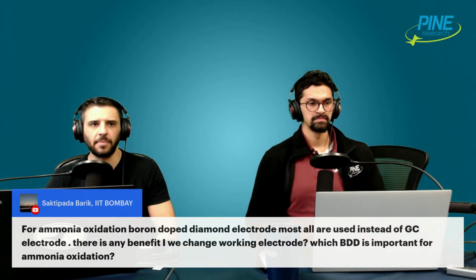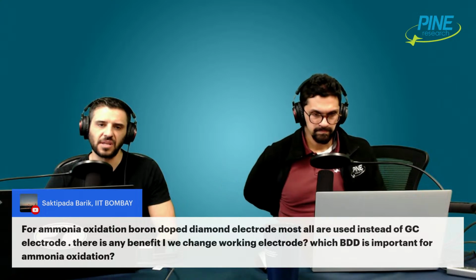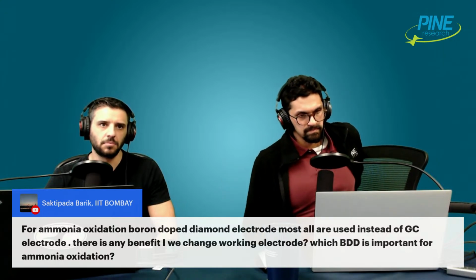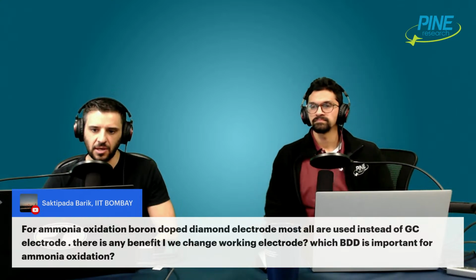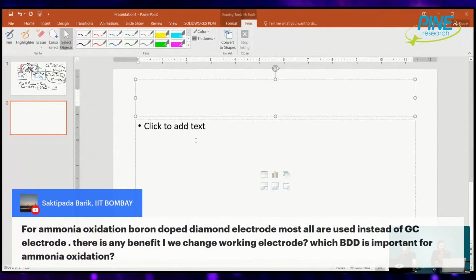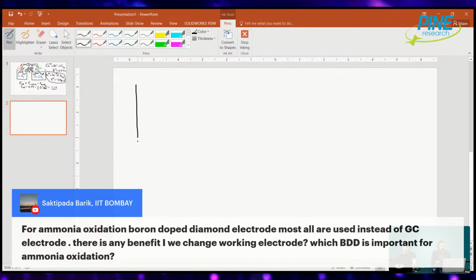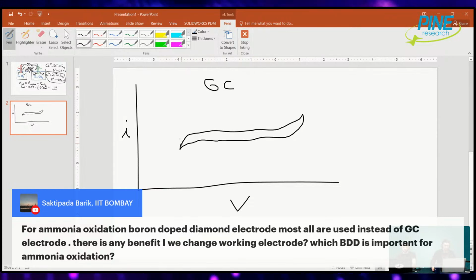Yeah, interesting. Boron doped diamond has a wider potential window than glassy carbon, if I'm not mistaken, right? It's more inert, like it's more background. So when you do a CV of glassy carbon, which is the natural comparison with BDD, you might get, I should draw it more so I can compare. Whatever limits you're going to do, you're going to get mostly just background until you get to the extreme ends where you have oxygen evolution and then hydrogen evolution.